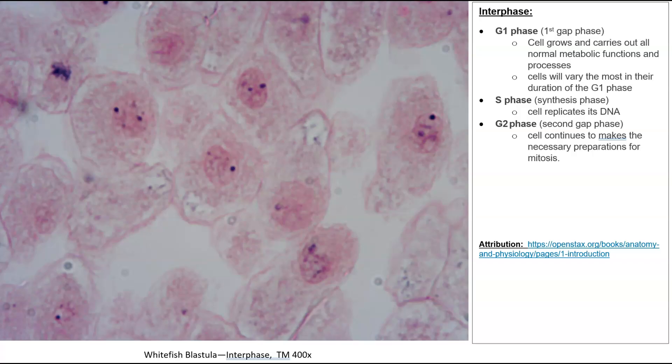Now we're looking at interphase at 400 times magnification. Sometimes you'll read that interphase is a resting phase, but that's not necessarily true depending on the type of cell. If it's a cell that will actively undergo cell division, it really isn't resting — it's a preparatory phase. During this phase, cells will replicate their DNA and go through a G1 and G2 phase. In simple terms, the cell is prepping for mitosis that will occur after interphase.